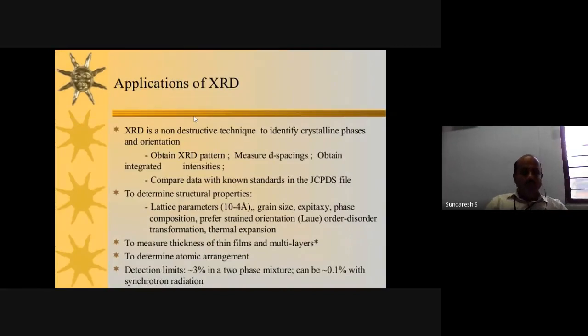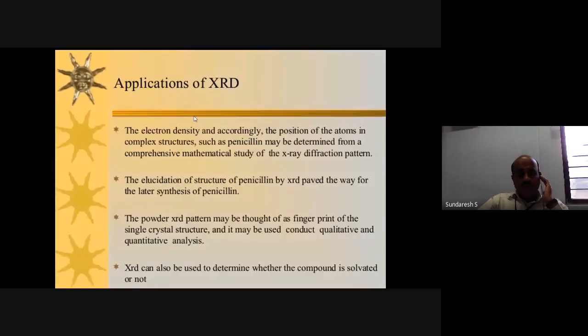Next, coming to the applications of XRD. XRD is a non-destructive technique. It gives the electron density, and accordingly the position of the atoms in complex structures such as penicillin may be determined from a comprehensive mathematical study of the X-ray diffraction pattern.